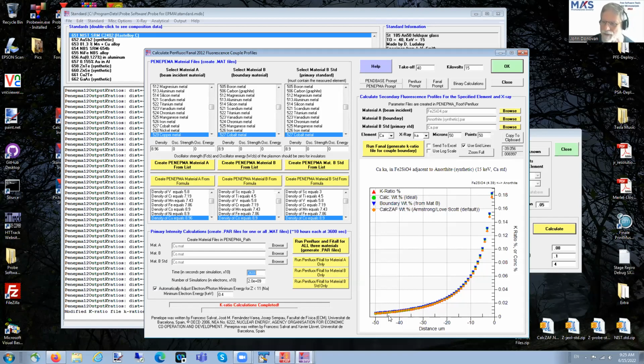I've seen so many of these curves that people think they can derive thermodynamic principles from, and I have to tell you, you're barking up the wrong tree. So use this app to give you an idea of where you may be in trouble or not with your trace element analyses near boundaries, because 50 microns might not be considered close to a boundary, but the microprobe can do 100 ppm quite easily, actually, with just a little bit of effort. We've demonstrated 2 to 3 ppm, t-test 99% confidence, for titanium in quartz. So that's another big problem, is people measuring titanium in quartz, and there's a rutile grain next to it. So that's not going to work.